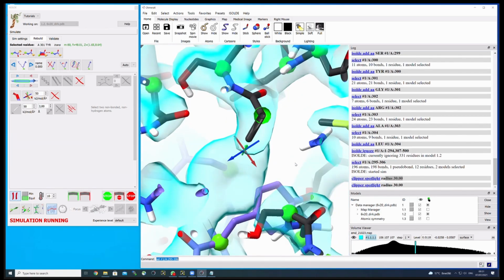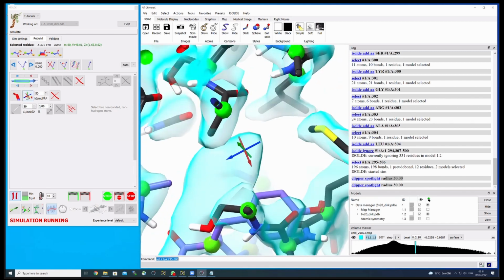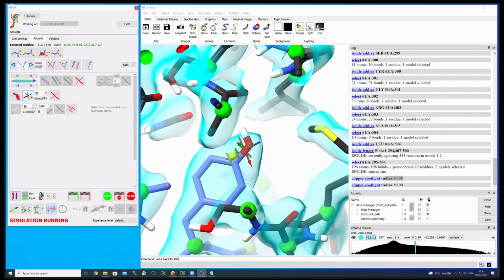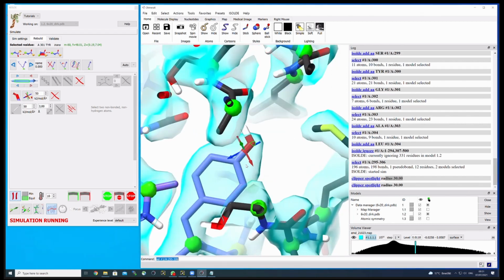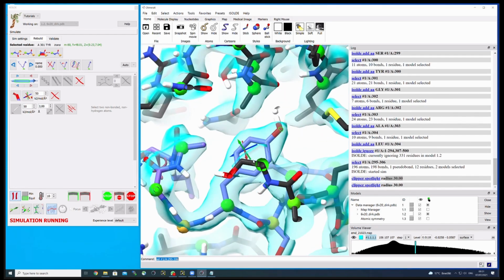Something like this, roughly. And then I use the second option, which is to move the atom that I marked to the pivot point, or restrain it to the position of the pivot point. Again, this can be done with a weight. If I do this, it will move there, and once I release and the density is stable enough, it will also stay there. Like this, you can basically bring many residues into their densities, even over longer stretches.